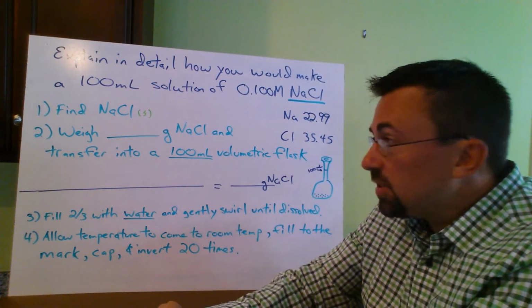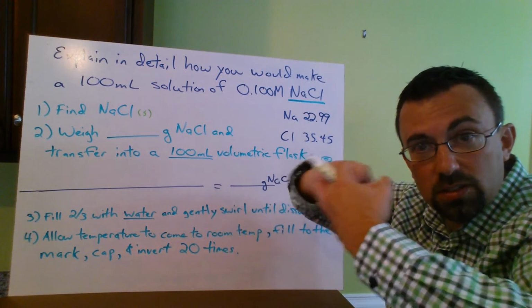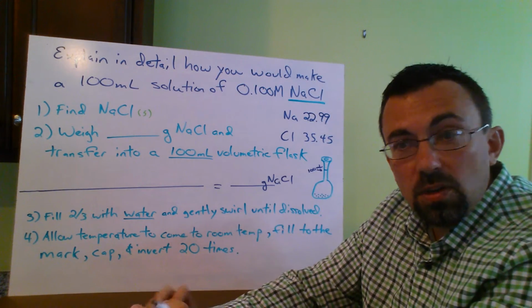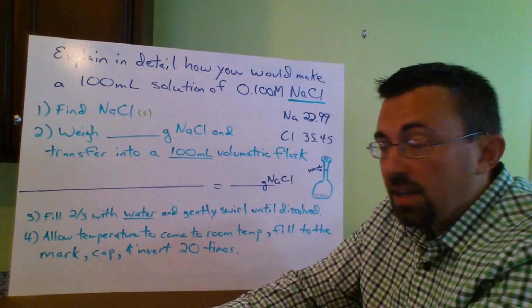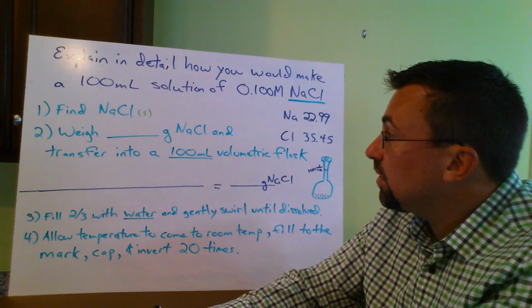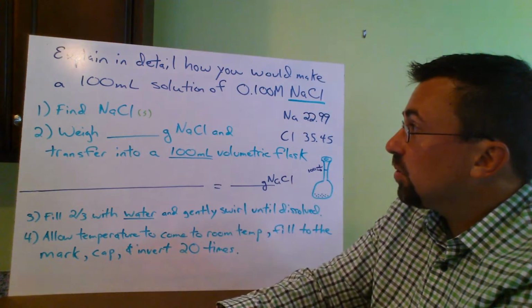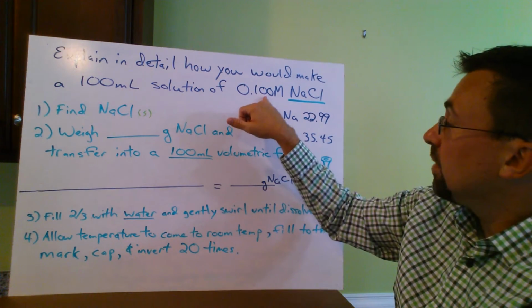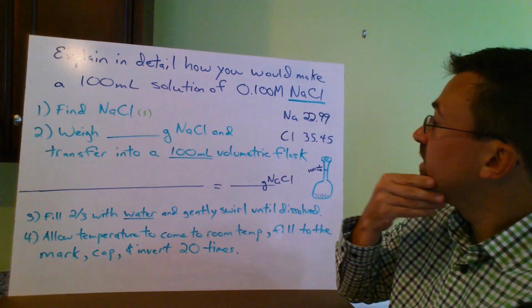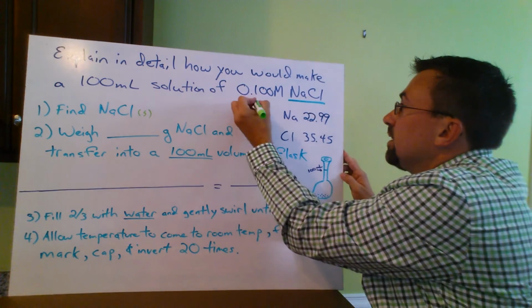It's an empirical formula. It's really 1 million sodiums stuck to 1 million chlorides, all interlaid with each other and stuck together. So these are almost universally solids, and they're going to be powders, and a lot of times they're stable this way. So you go into the lab, find the bottle that says sodium chloride, and pick it up. And of course, I don't know how much I need. That big M is blank per blank. It's moles over liter.